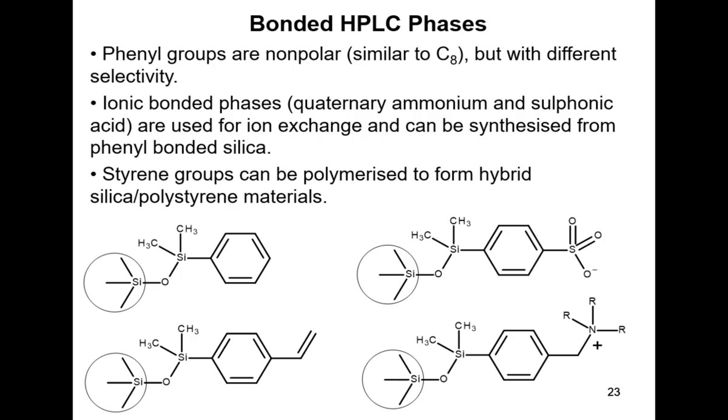So, why would you want to do that? Polystyrene is a relatively soft material, so it doesn't cope so well with very high pressure elution.